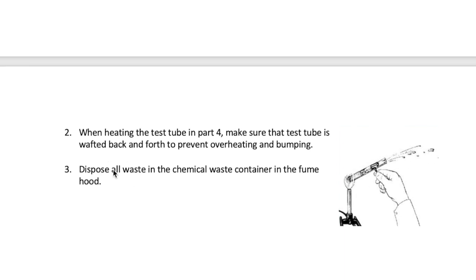The last part of this is to make sure that all the waste that you have in this experiment is discarded in the chemical waste container, which we have in the fume hood.